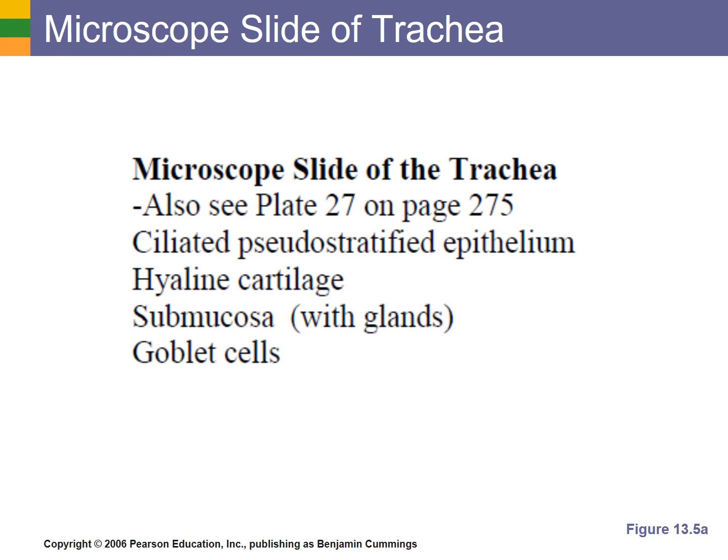You could also be asked to identify several structures listed on your study guide from the microscope slide of the trachea. Those structures are listed here. Let's look at an actual slide of the trachea.